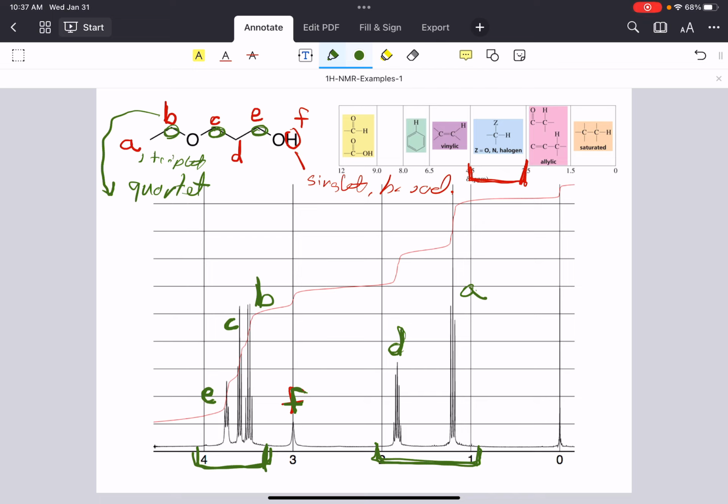All right, so that's been a series of examples of how you can move through an NMR spectrum systematically, taking advantage of those 3 pieces of information that we have: chemical shift, expected splitting pattern, and integration. And that way we can go through and actually look at assigning each individual peak in the NMR.